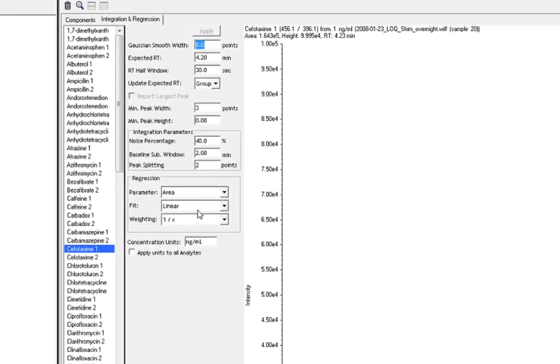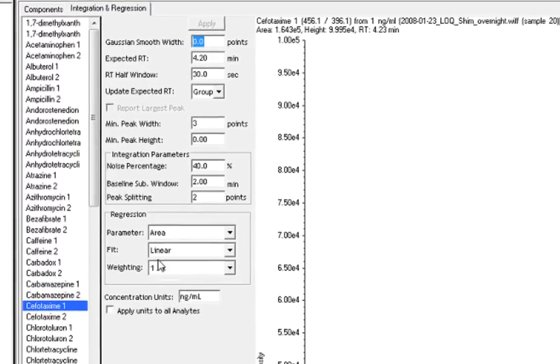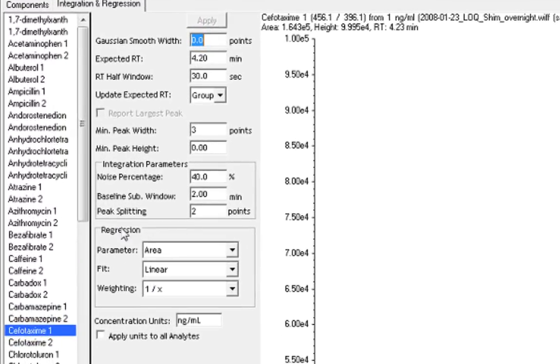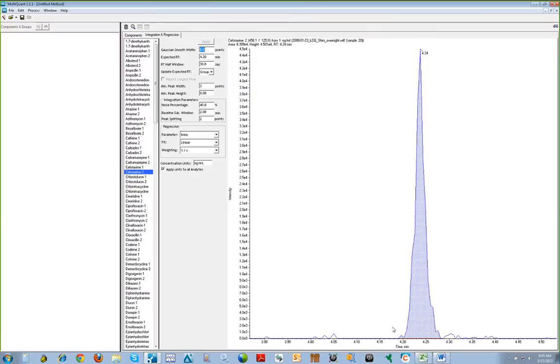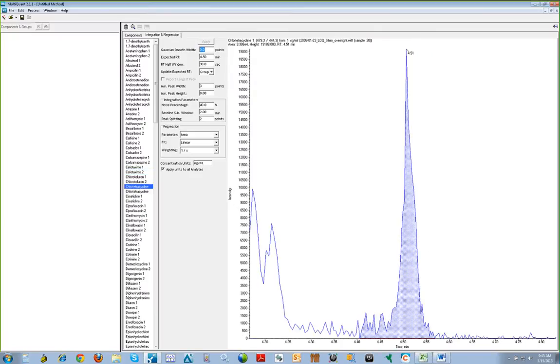We will also review our regression parameters. For this method, we are using linear fits with 1 over x weighting based on the peak areas. We can also adjust the concentration units reported for our analytes in this window.